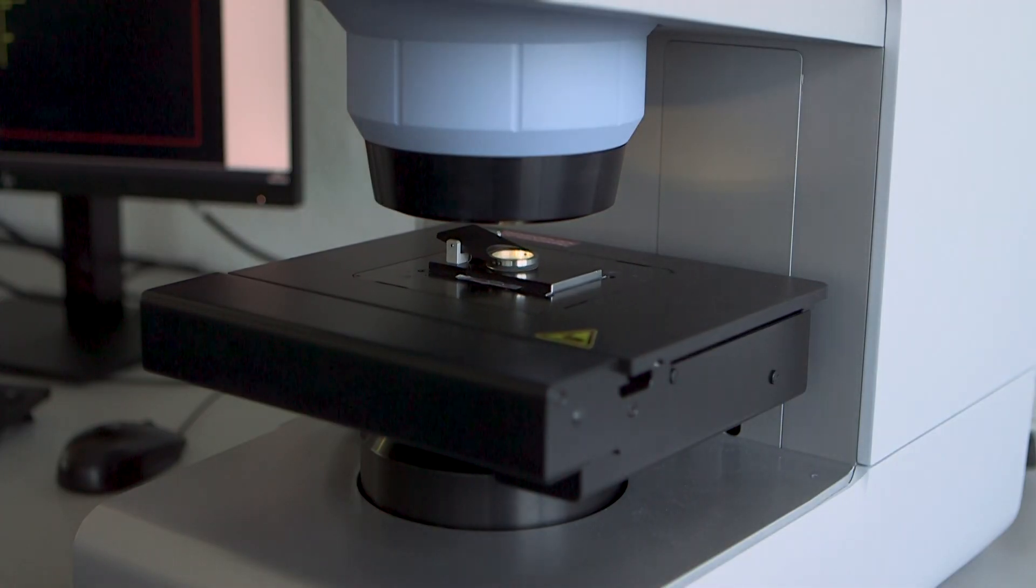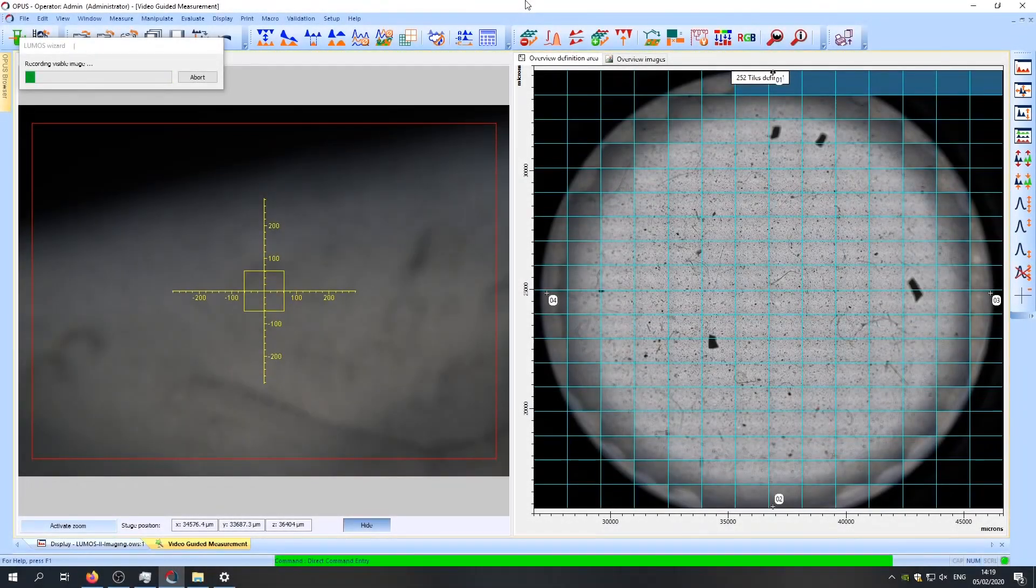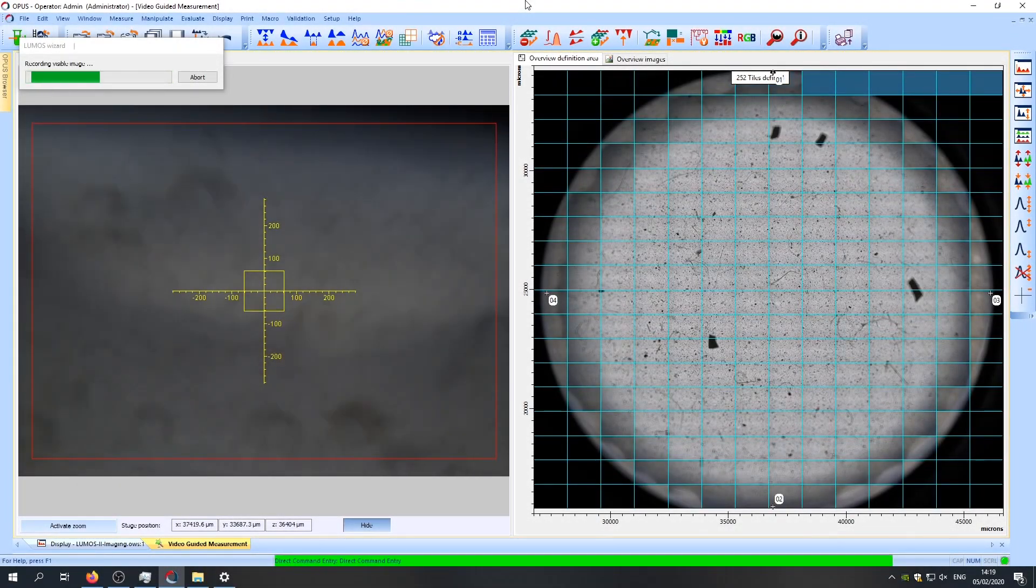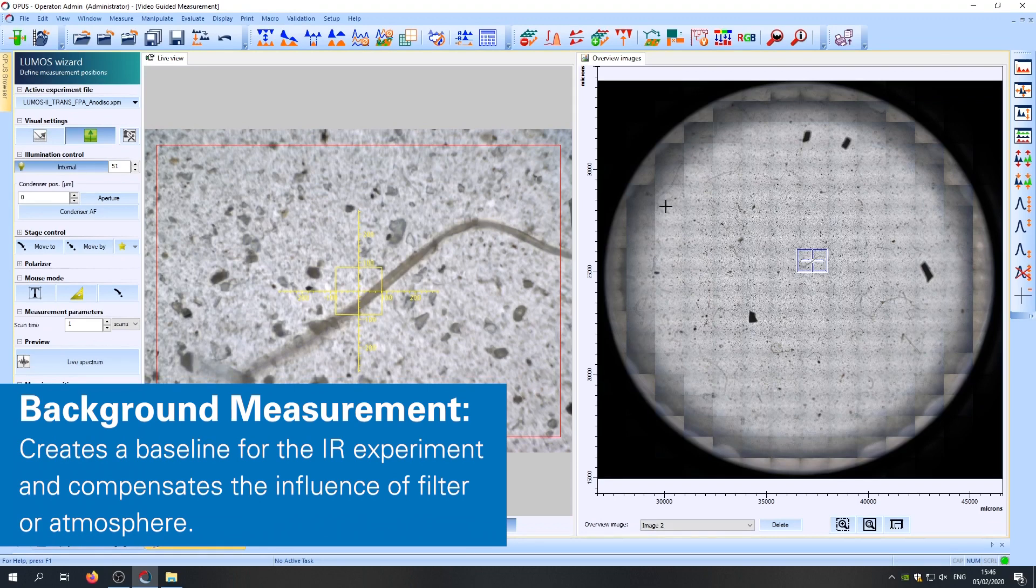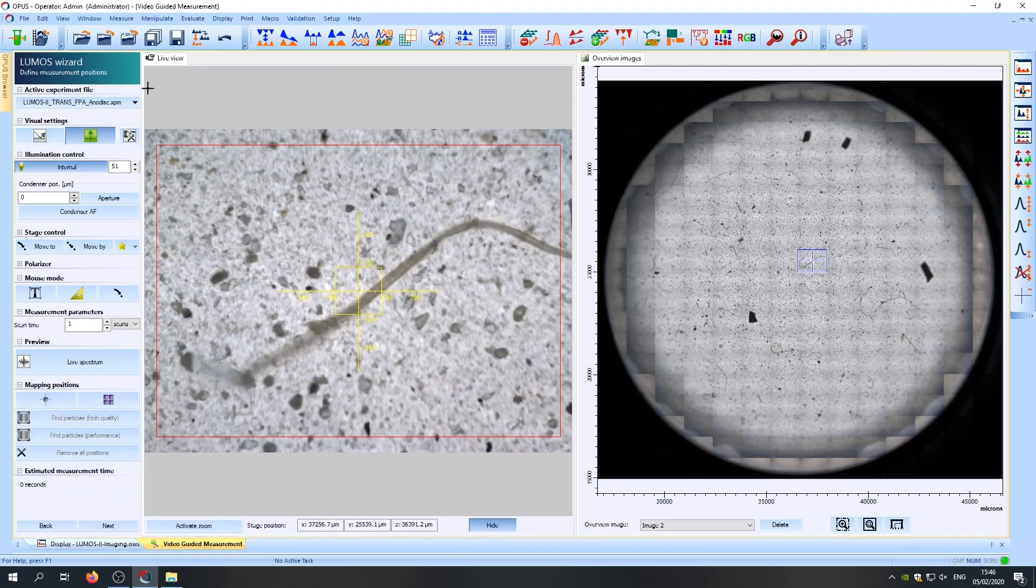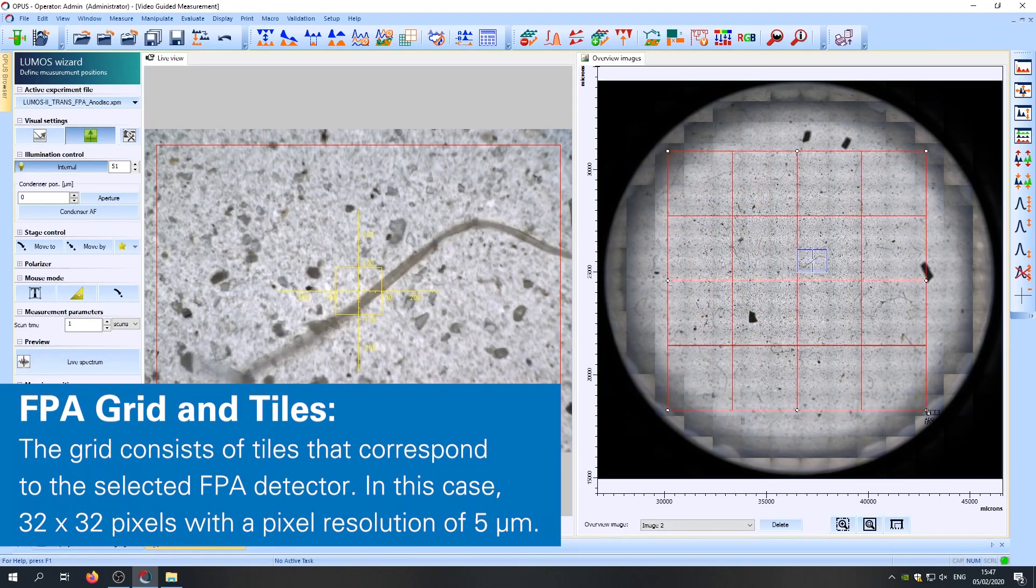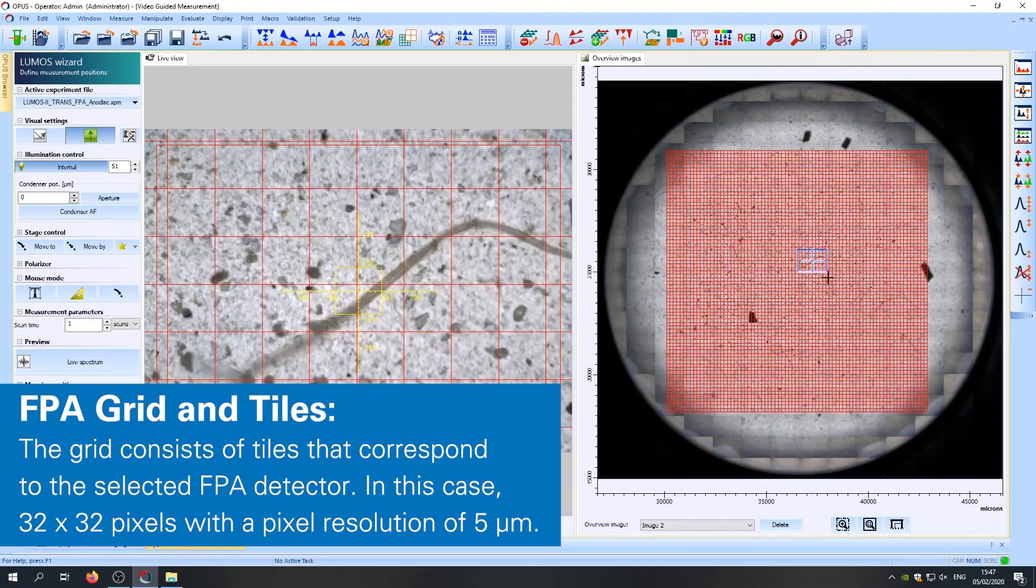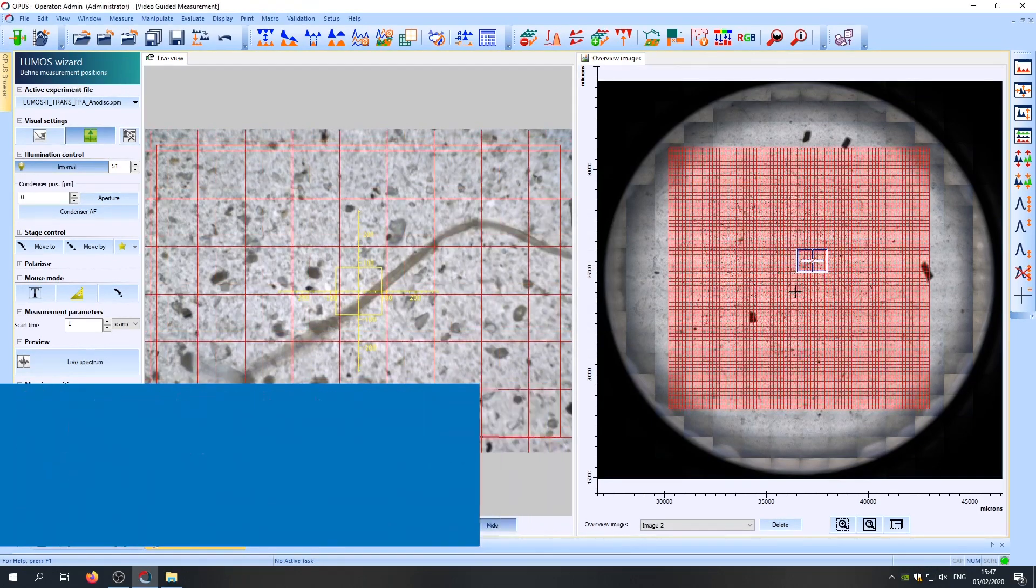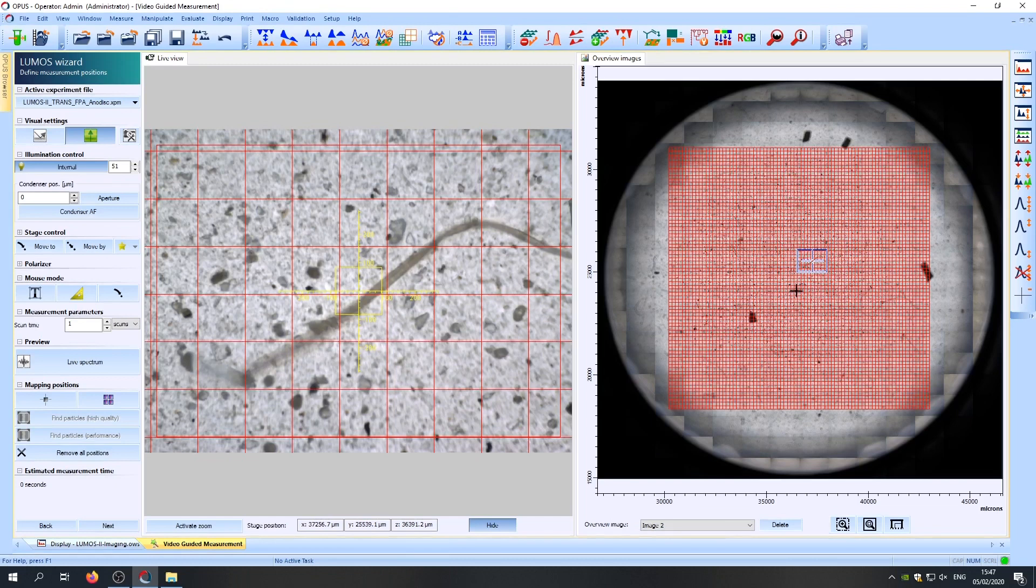When the recording of the overview image is done, we're going to go and define our measurement area. After we have collected the background, all we need to do is define the measurement area. Our parameters have been set to predefined values and can be changed here. Now we just place an FPA grid over the area we want to cover and the software will give us the corresponding number of tiles we need. Each tile consists of 32 by 32 pixels and has a spatial resolution of 5 microns without binning.